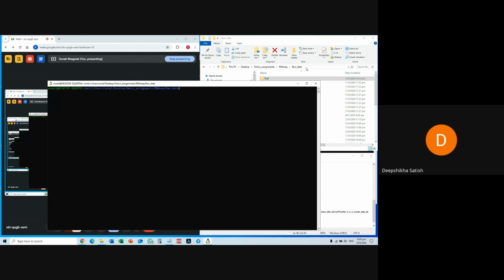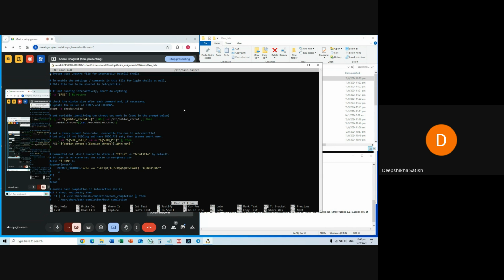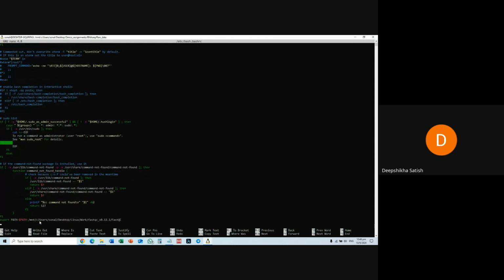So yeah, you open. Just write here sudo nano /etc/bash.bashrc. Enter. Do it from the keypad. Yeah, go down. Yeah, here it is.